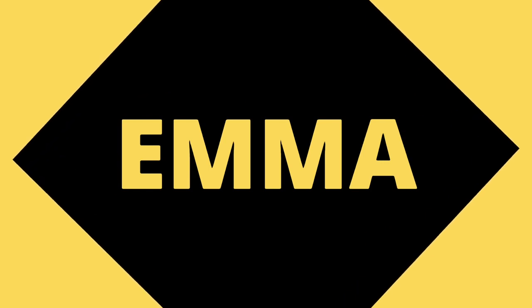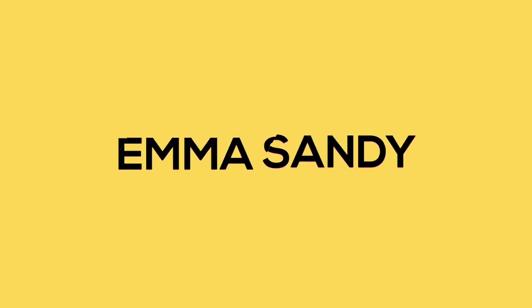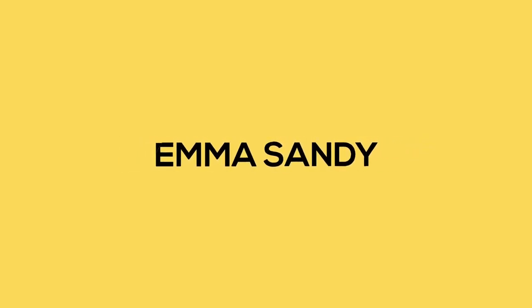But today I'm going to tell you exactly what you need to know about flow cytometry and FACS. So today I'm going to give an insight into flow cytometry and FACS, what the difference is between the two, how the machines work, what the data means, and I will walk you step by step through analysing some of my flow data. So let's go!